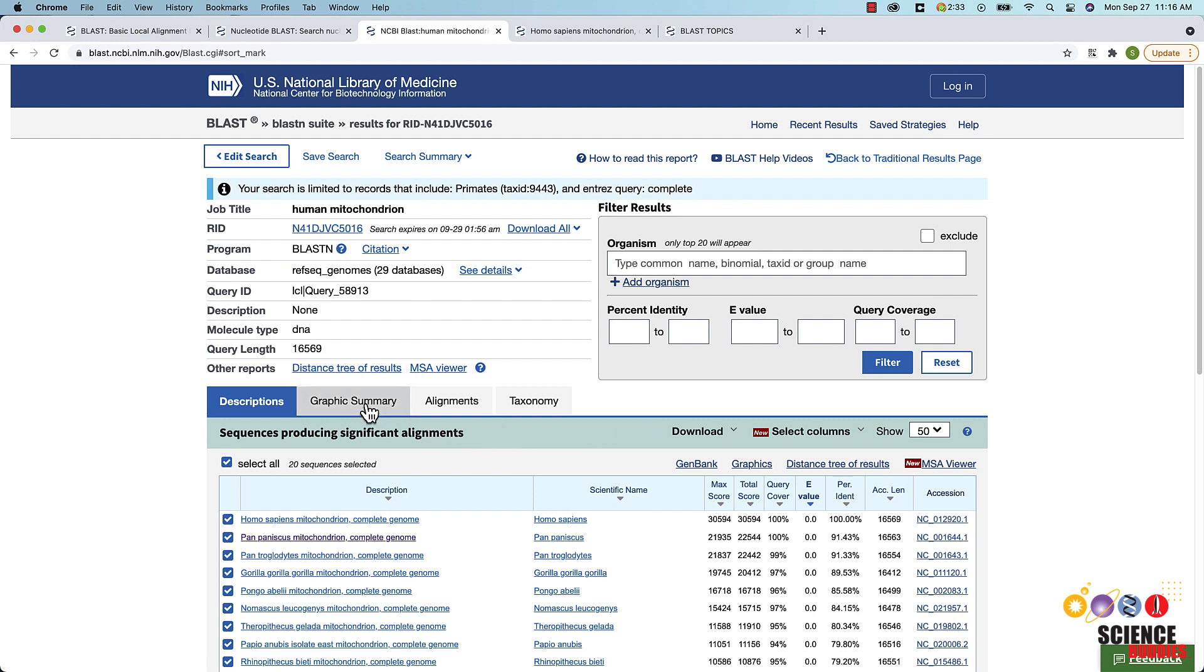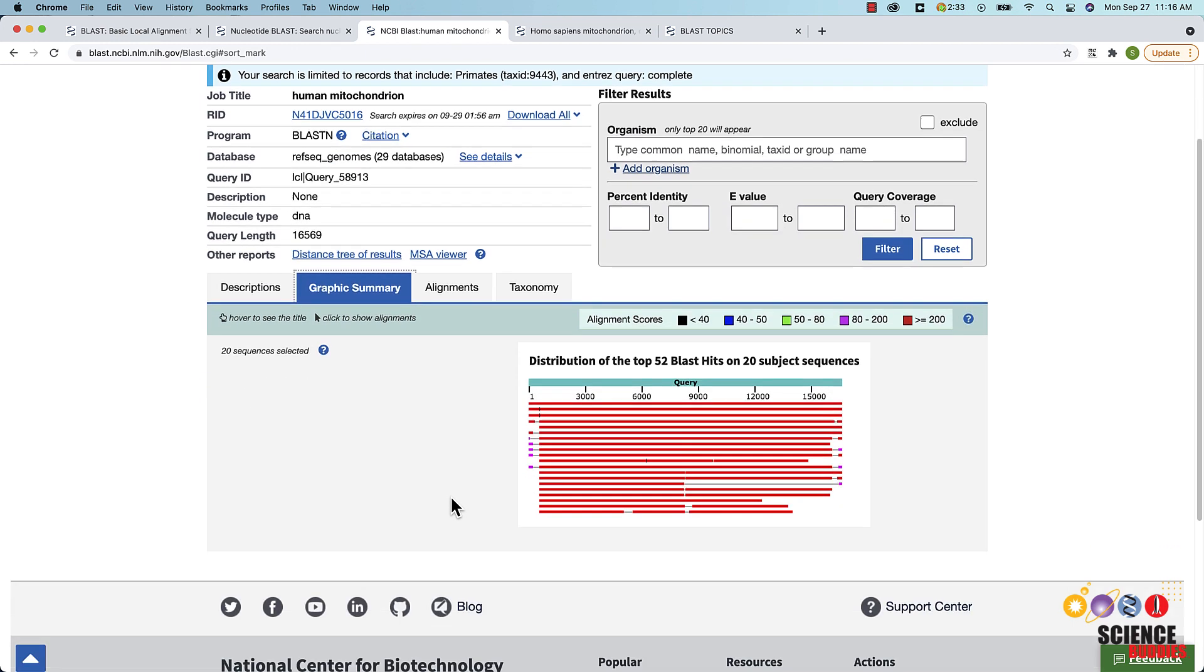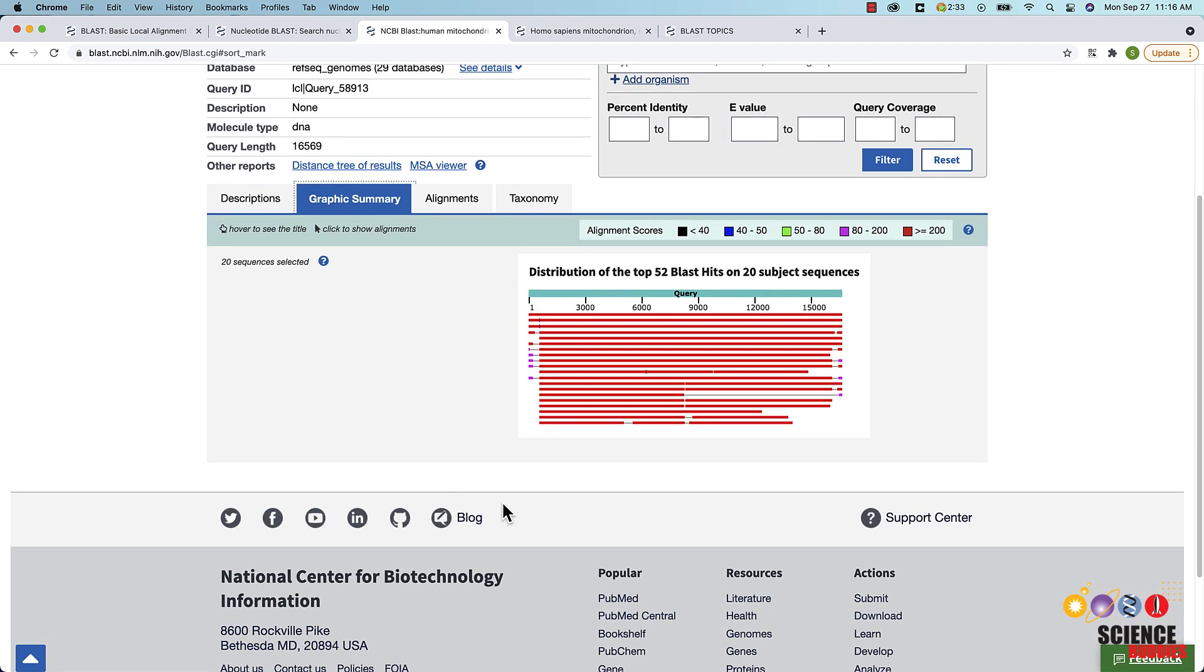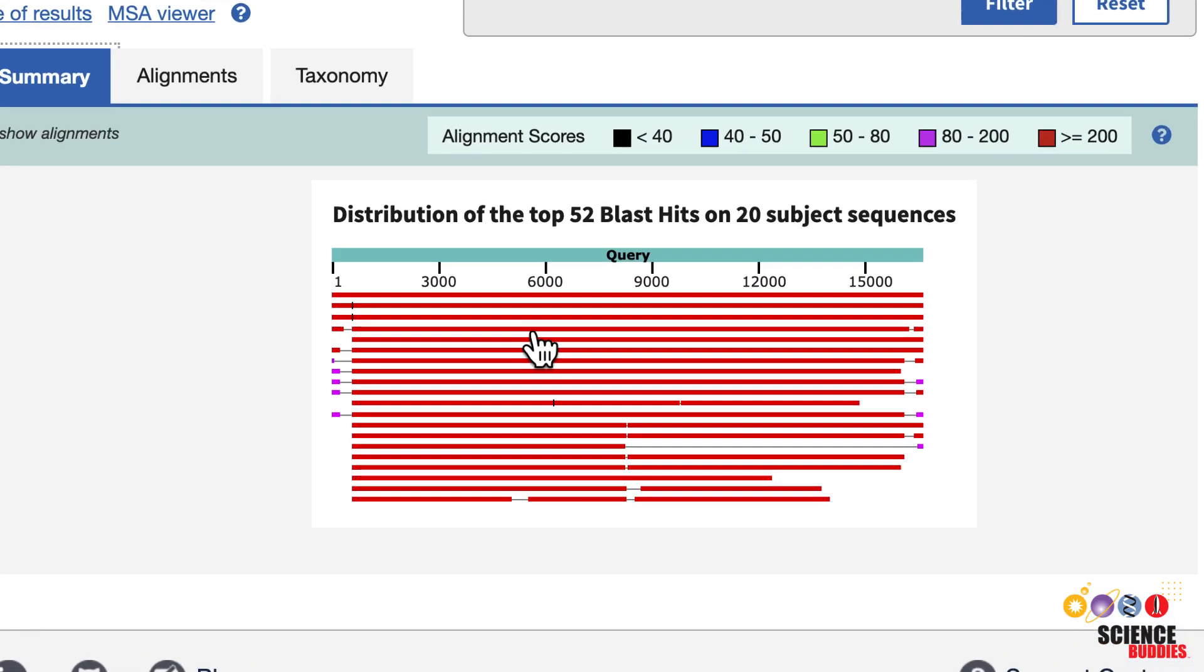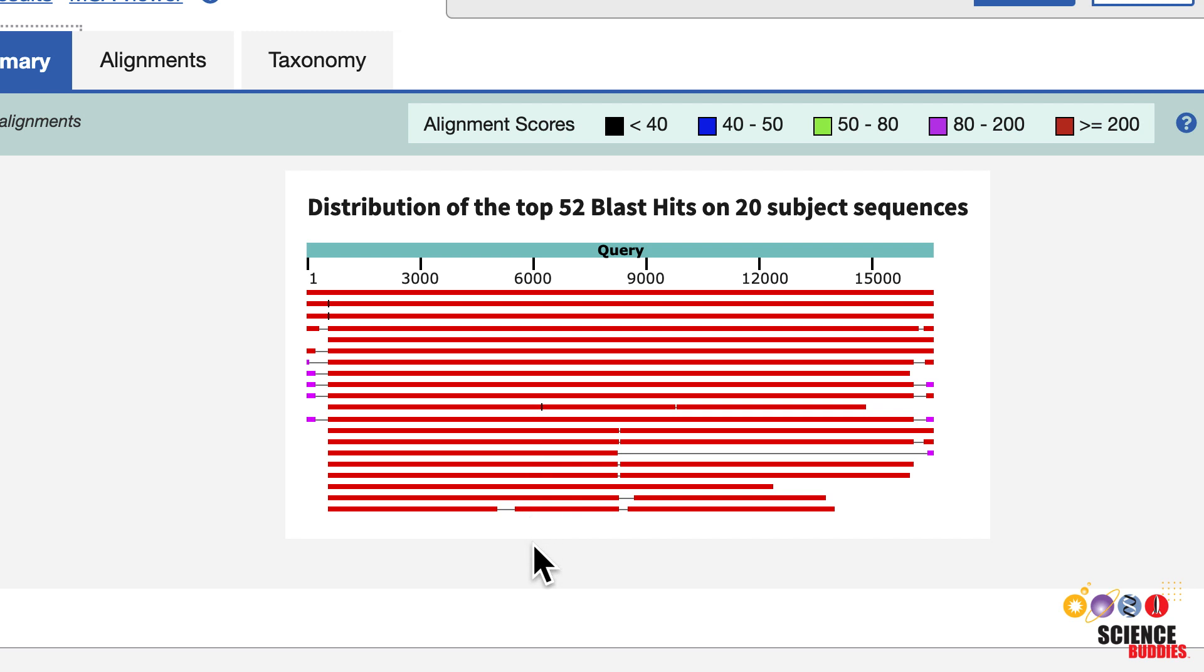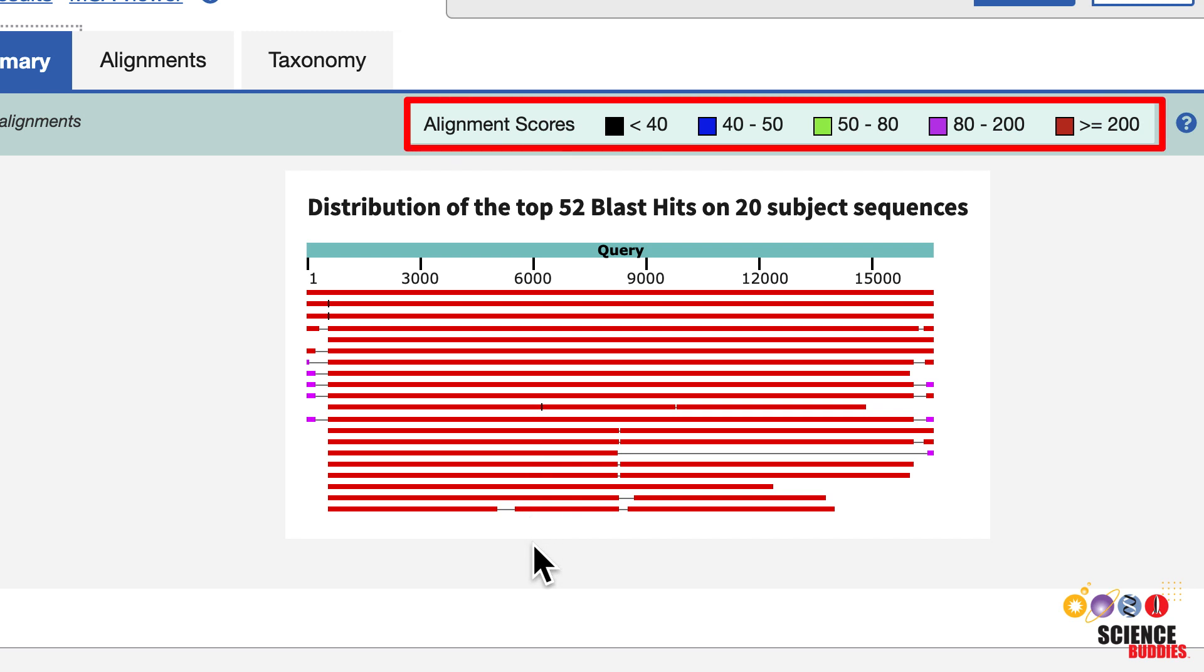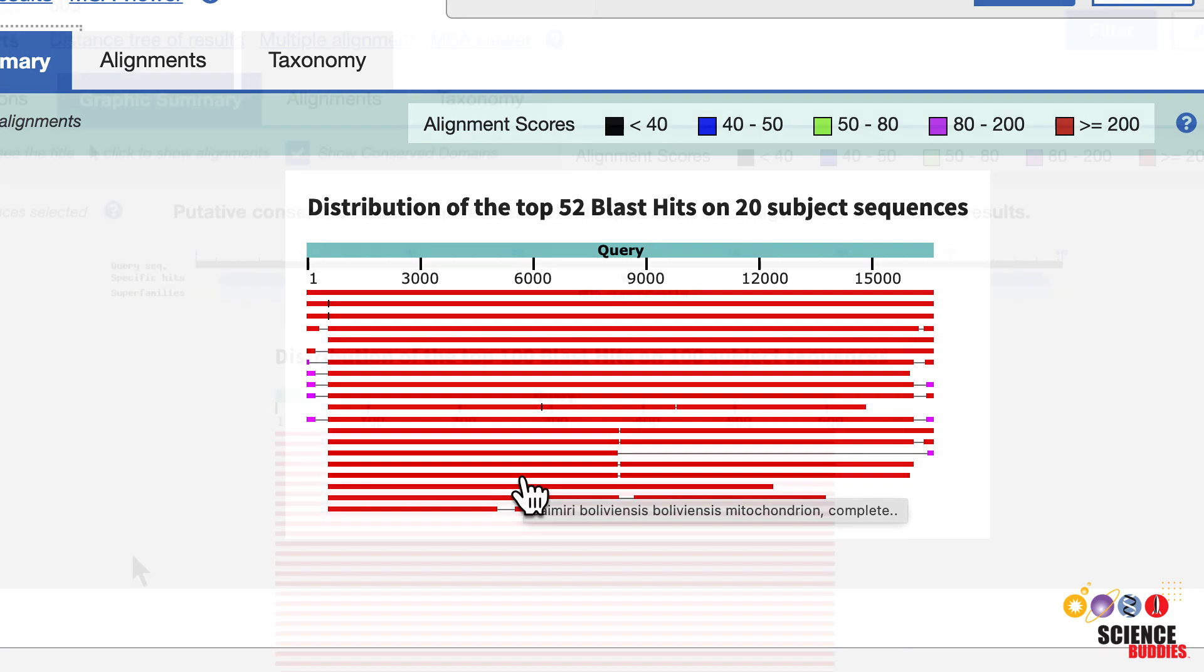The graphical summary tab provides a graphical overview of the alignments between your query sequence and the database sequences in your BLAST results table. The query sequence is shown at the top. The colored boxes underneath correspond to regions in the query that have sequence similarity to the database sequence. The boxes are color-coded based on their alignment score. Hovering over a BLAST hit makes the title of the database sequence appear.